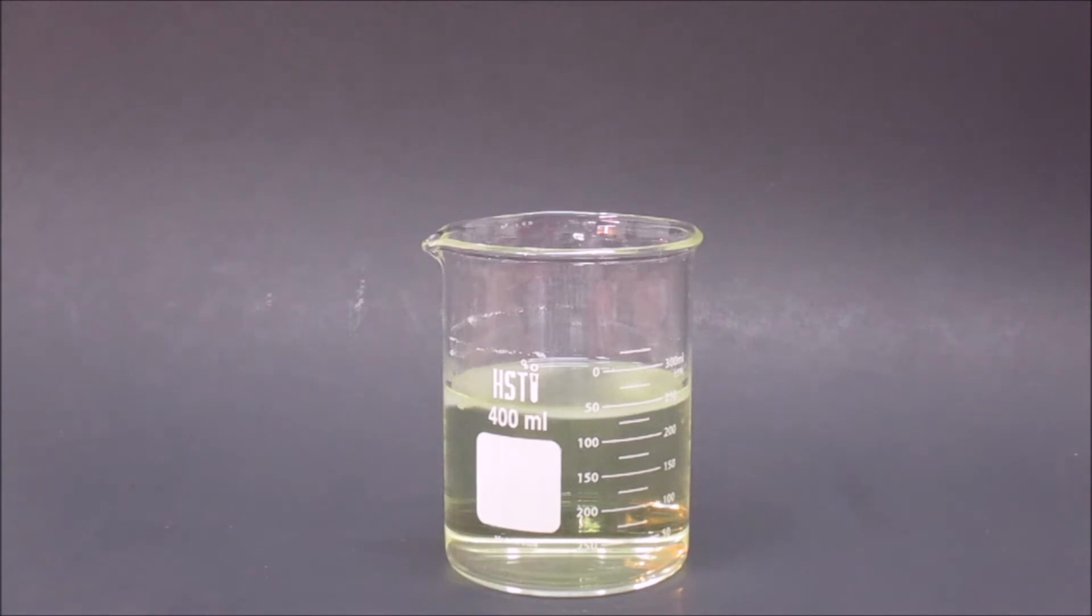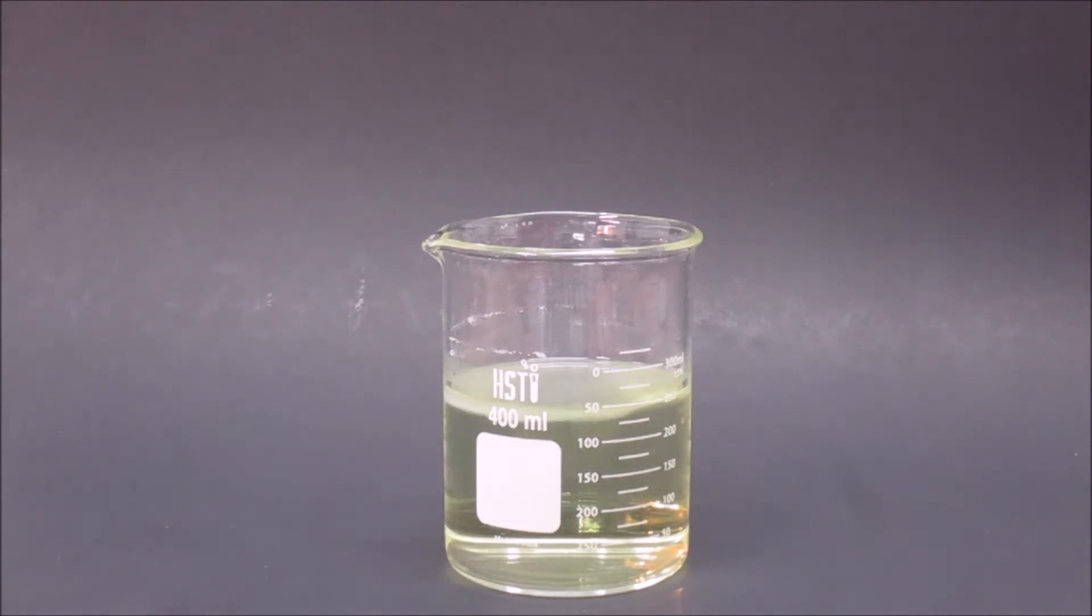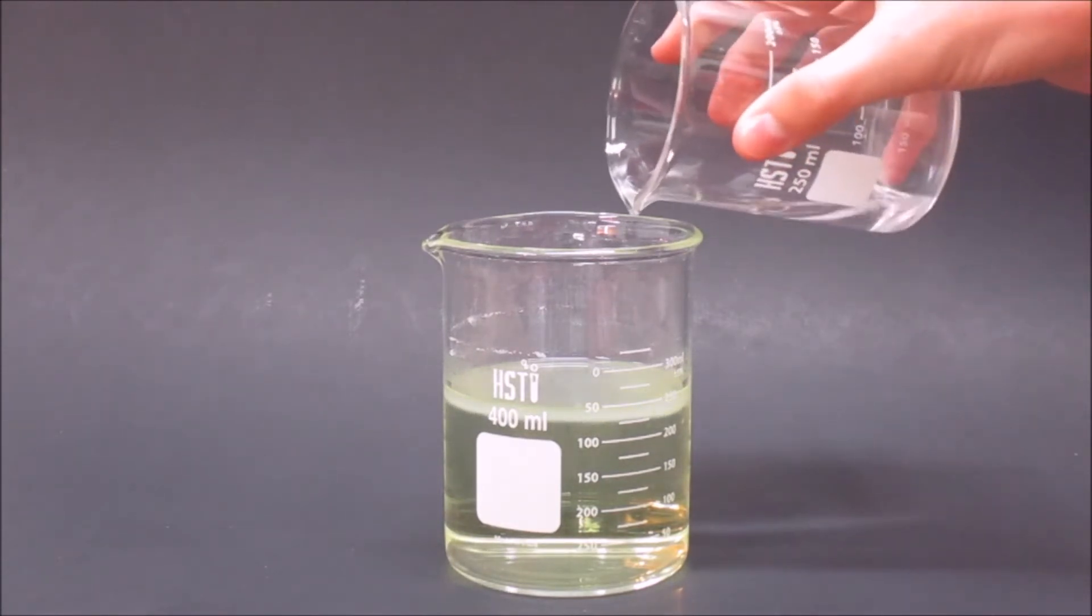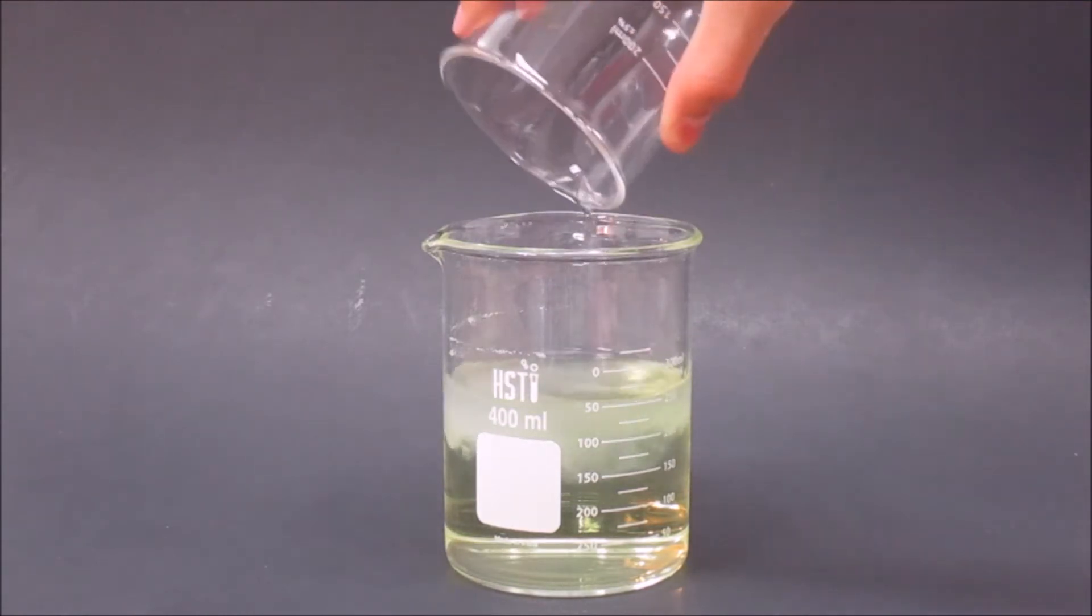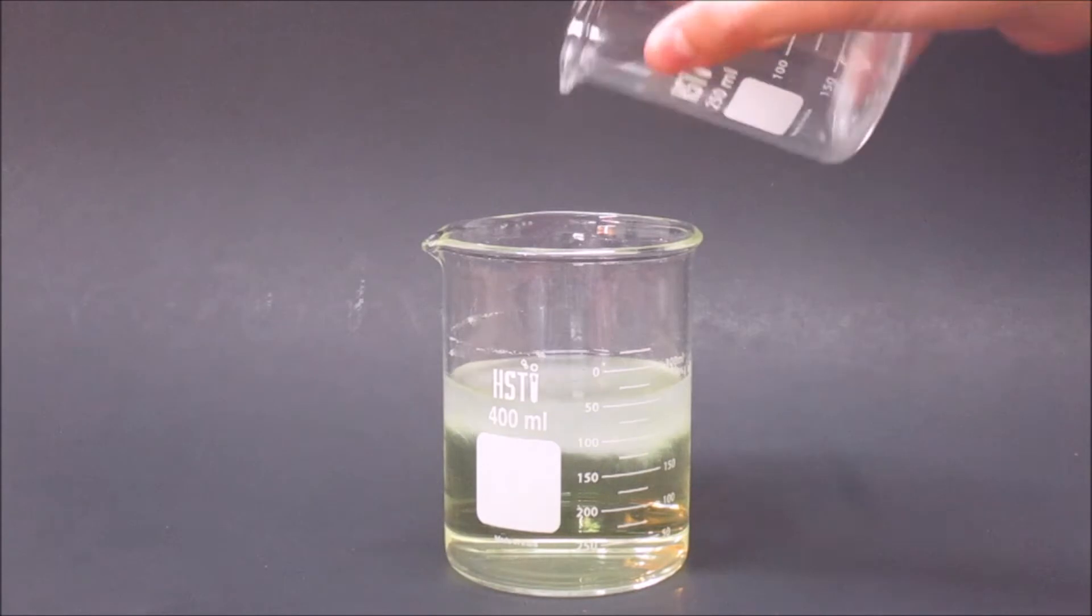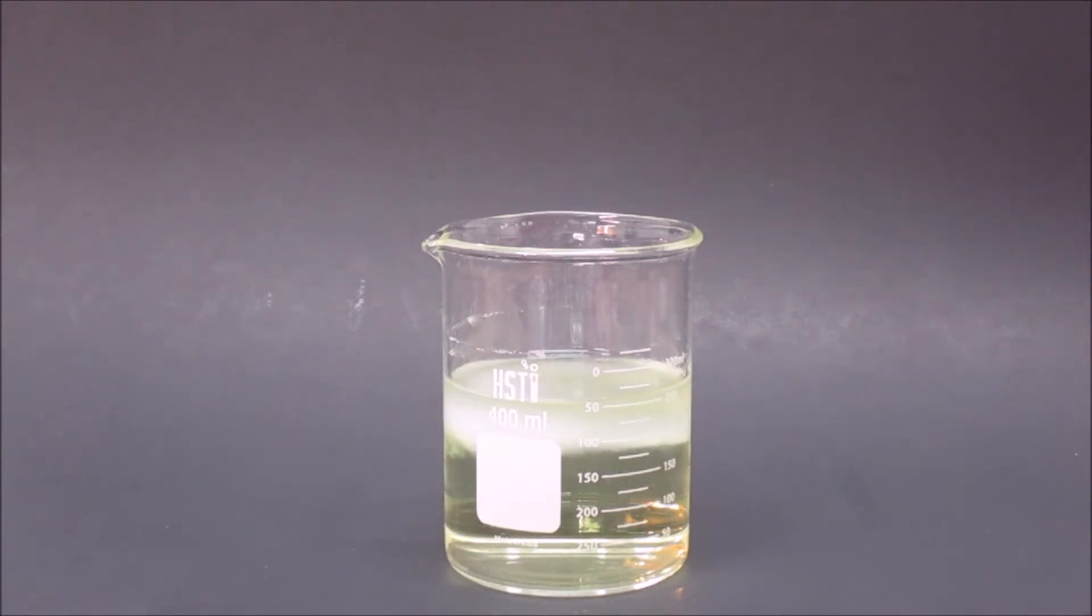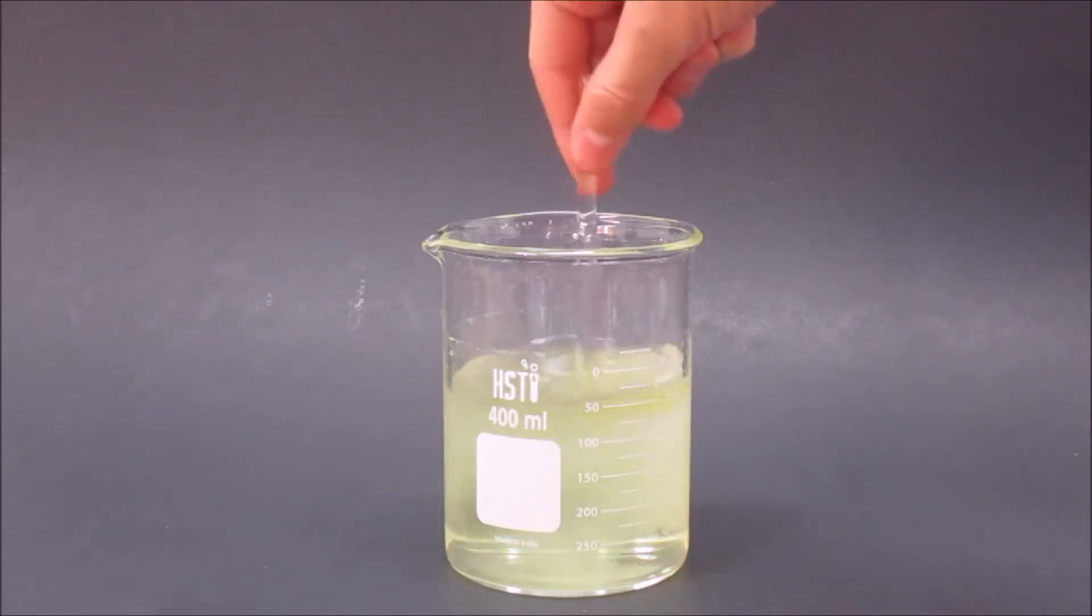A little while after the acetone was added, you can see a white layer forming on top of the bleach. I'm not exactly sure what this layer is, but I think it's a layer of chloroform on top. Then I stirred everything around to mix it up.